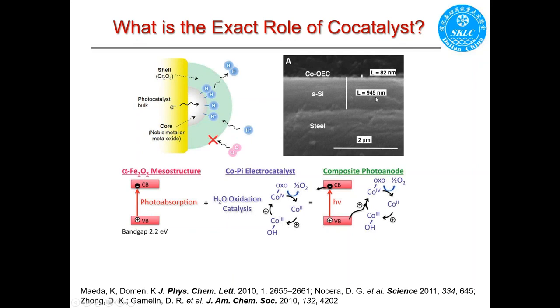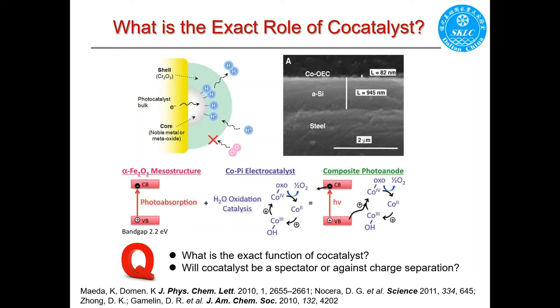And there are several questions. The first one is, what is the exact function of a co-catalyst? Another one is, will the co-catalyst be a spectator, or sometimes even work against the charge separation in these systems? So now we are trying to figure out what happens on these micro to nanometer sized crystals.